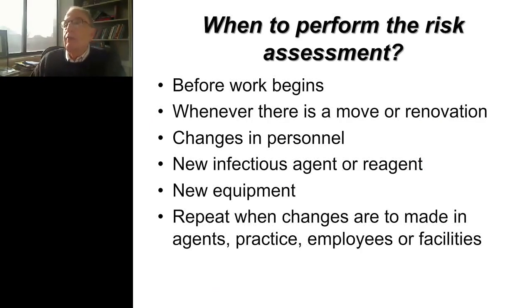When to perform that risk assessment? Well, it's best to perform it before work begins. You want to be able to have anticipated the problems before people actually experience problems. So doing it before work begins is best, but that's not always possible.